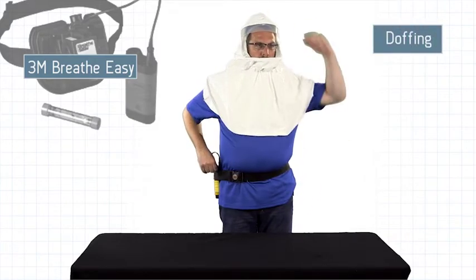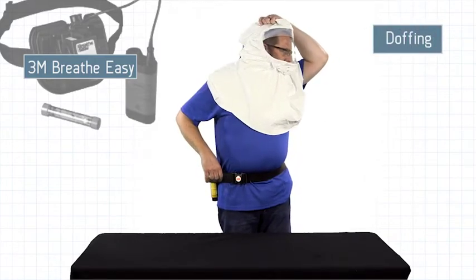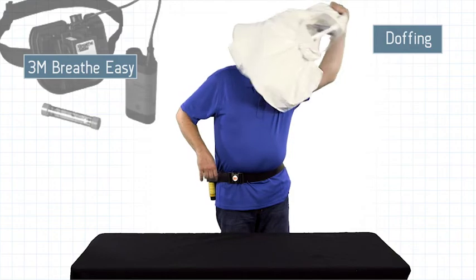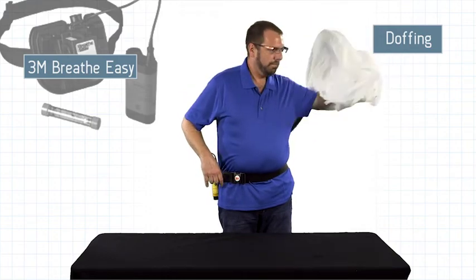To doff, turn the PAPR unit off. Remove the hood by grabbing a generous amount of fabric at the top and gently pulling out and away.